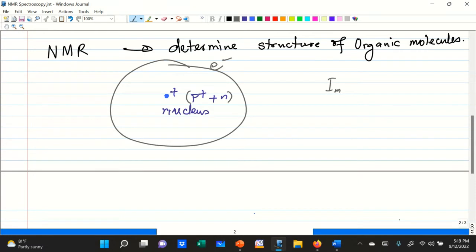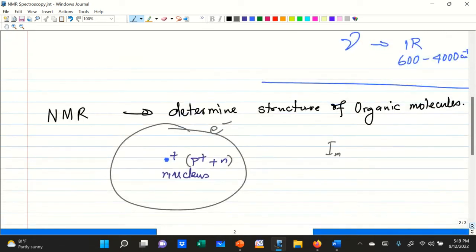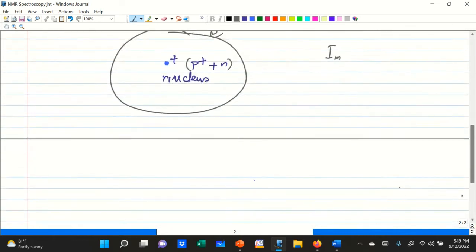This magnetic moment will have a resonance in NMR when it has a certain value, and that value is possible when the spinning nucleus has an odd number of particles in total, which is what you call the mass number.